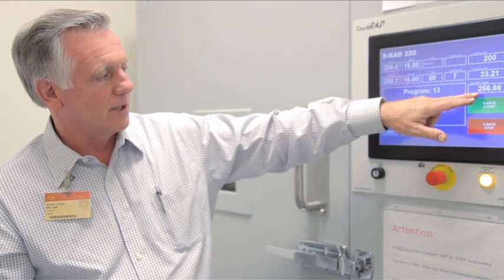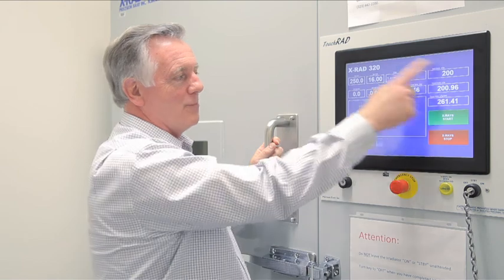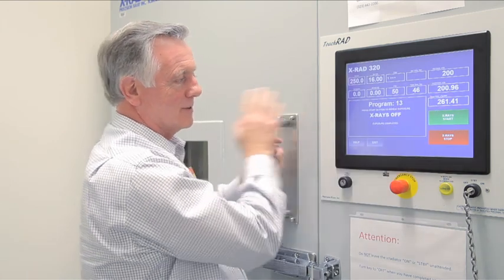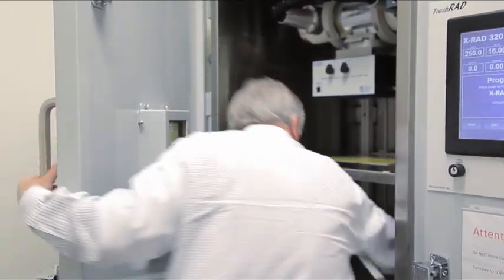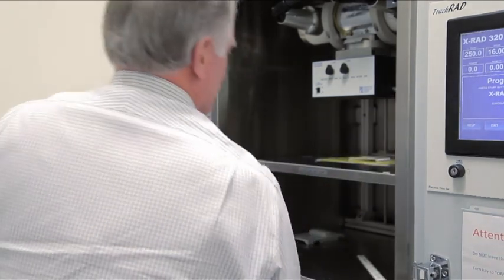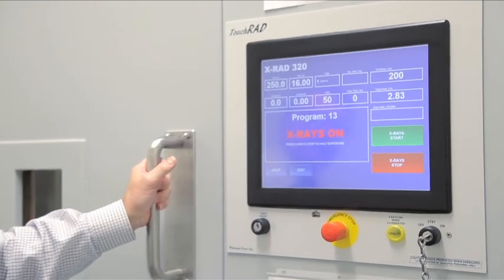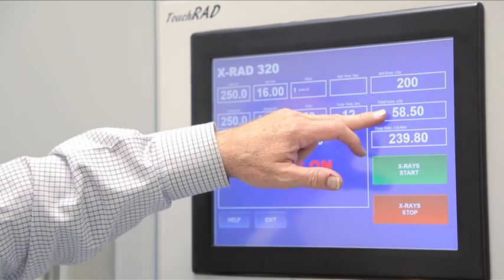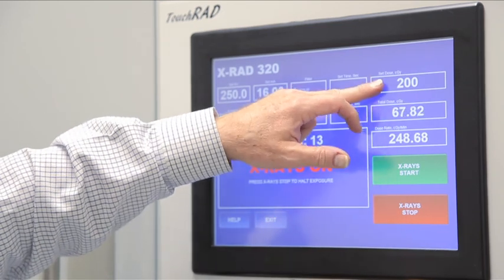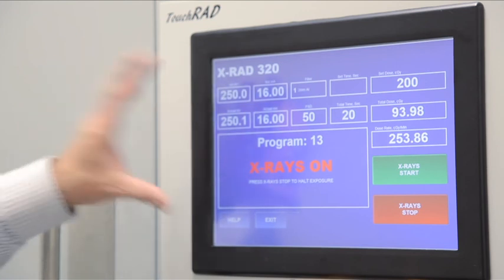After a few seconds, it shows you the dose rate. This shows the total dose, and that is the dose you're trying to get to. If you want to repeat a dose, you remove your original sample, put in your new sample, verify the filter, close the door, and just press start again. This shows you the dose rate, this shows you the total dose, this shows you the dose you're trying to get to, and this is the amount of time remaining. It will stop automatically.